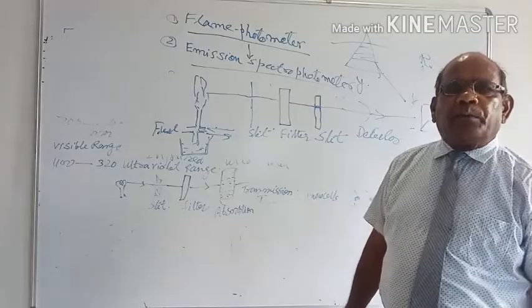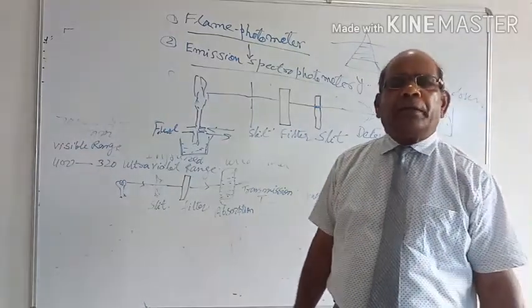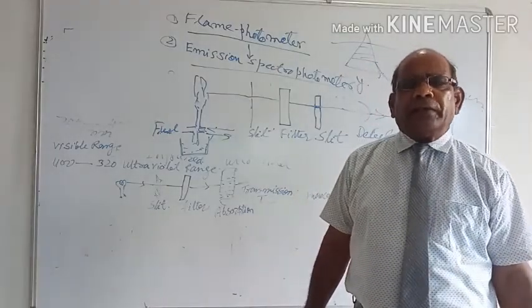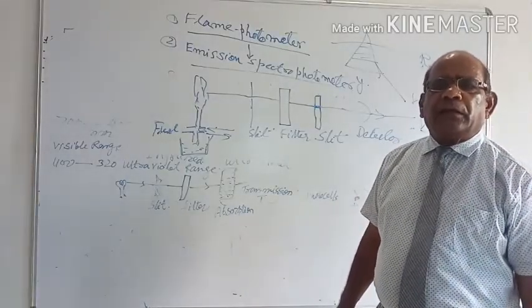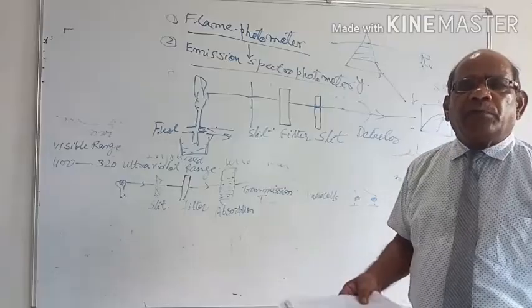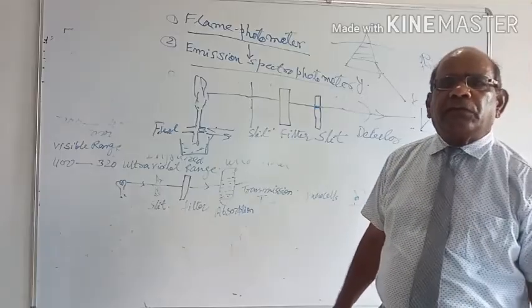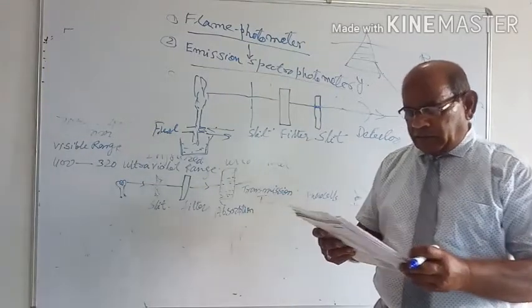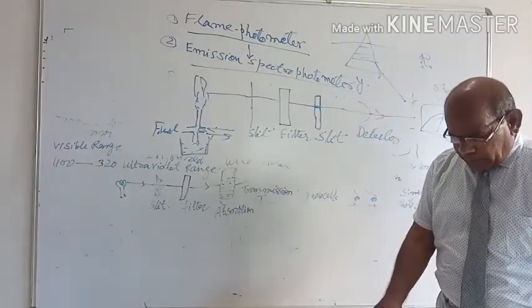Lithium is one of the important bioingredients for the estimation of the level of lithium in mental patients. So the basic purpose of application of flame photometry in the biochemical laboratory is the accurate estimation of sodium and potassium, and lithium on special request for mental status estimation.